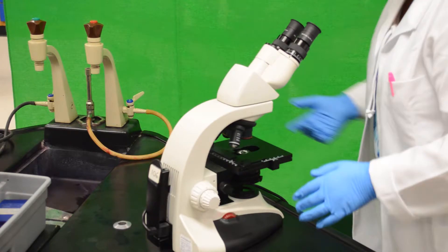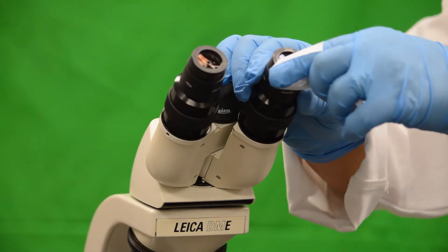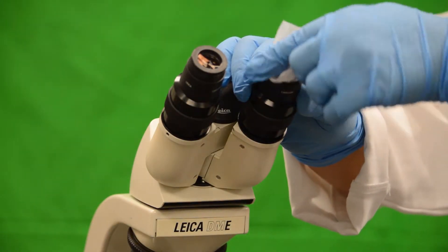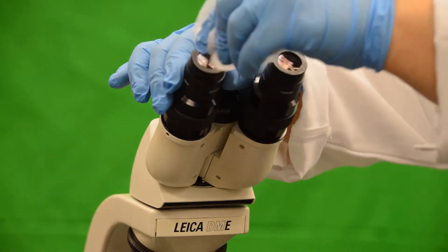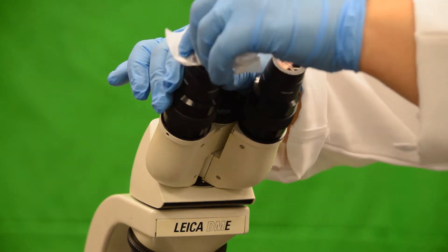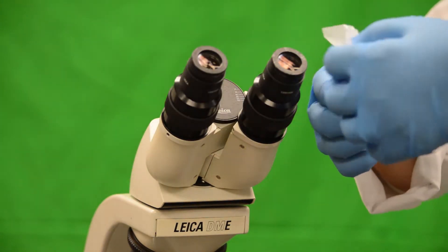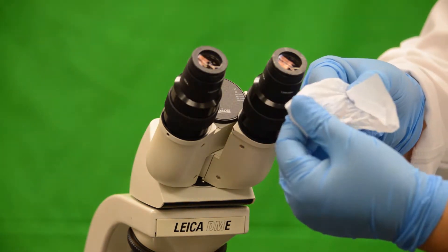Before using the scope and after use, clean all the lenses with lens paper and lens cleaner. Also, during use, clean the lens if there is a smudge, streak, or unevenness in the clarity of your image.